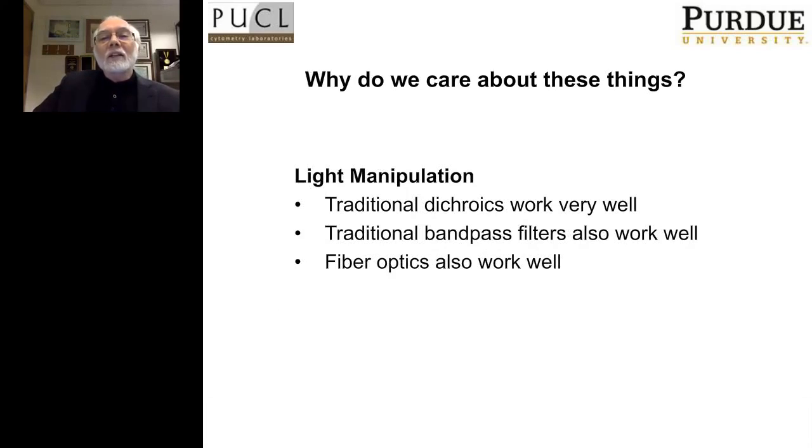If we look at light manipulation, the traditional dichroic and bandpass system that almost all flow cytometers use works very well. Also, fiber optics work well. So why would we change something that's so fundamental? And I'll try to answer that question.